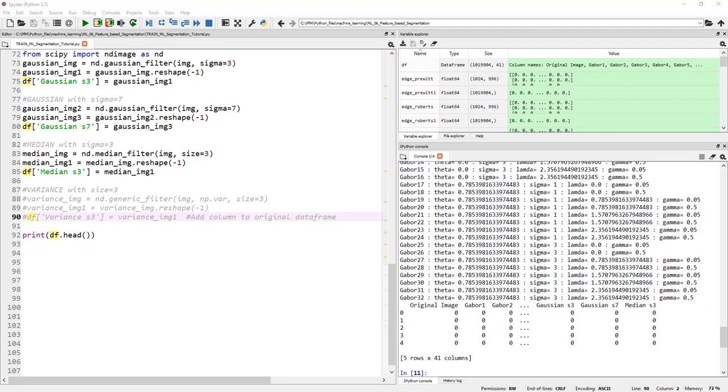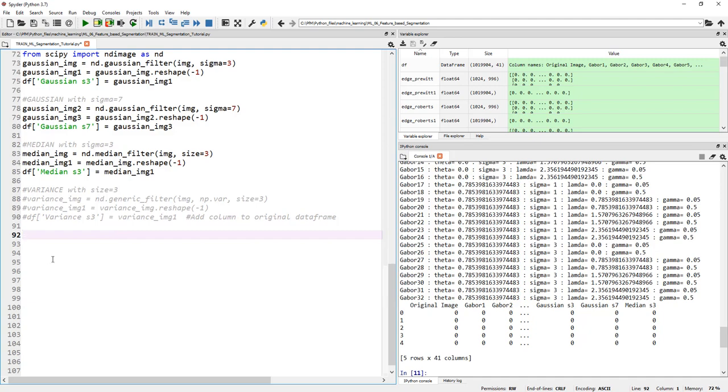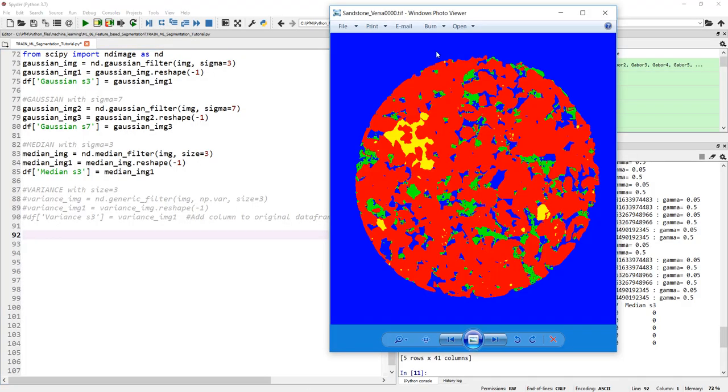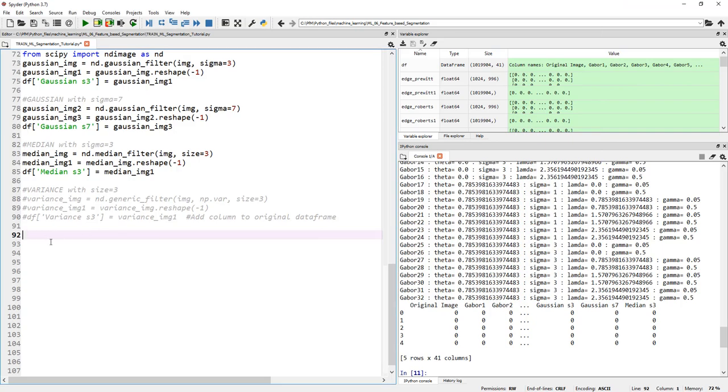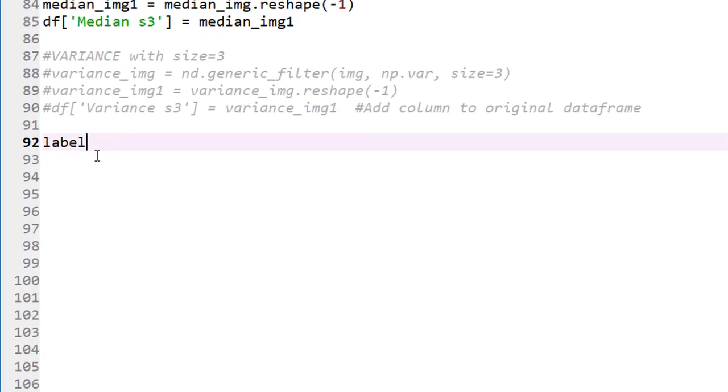There is our final data frame. One last step before we move on: adding another column. So far we've added all the feature columns. Now we need to add another column that corresponds to the labeled image. Now that we've added at every pixel what the pixel value is, what Gabor 1, 2, 3, up to 32 is, and Gaussian, median values and so on, we haven't told what the ground truth is. Remember, we're doing training. We need to tell what the ground truth is.